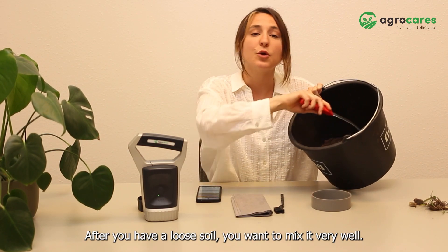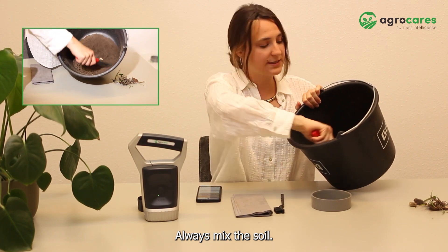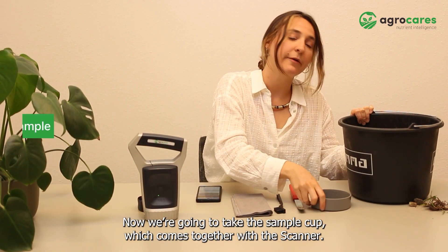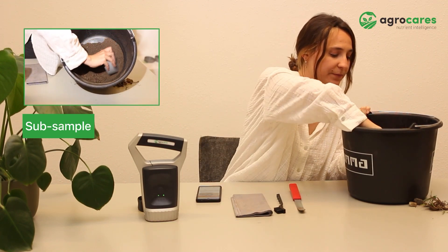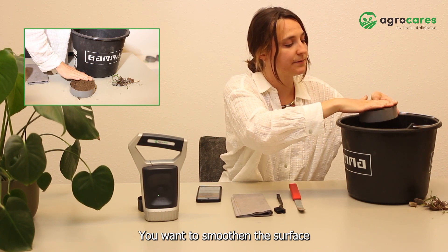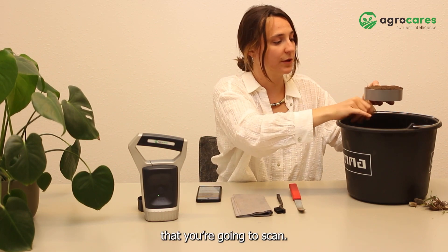After you have the loose soil, you want to mix it very well. Always mix the soil. Now we're going to take the sample cup, which comes together with the scanner. You want to scoop a sub-sample. You want to smooth the surface, and then make sure that you have a thick layer of soil that you're going to scan.